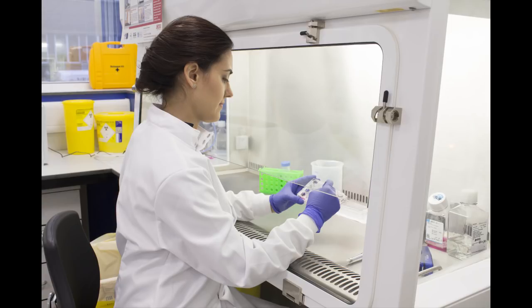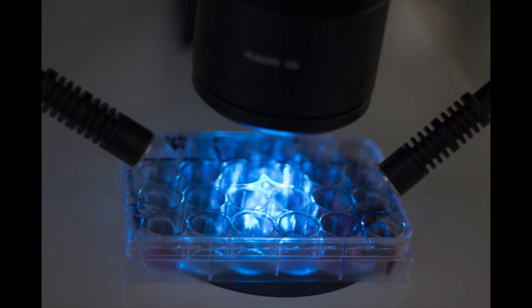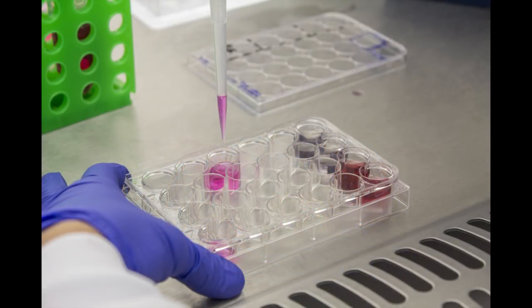Live-dead staining and MTT assay were performed to assess cell viability and metabolic activity respectively. The presence of collagen was identified using Sirius red.